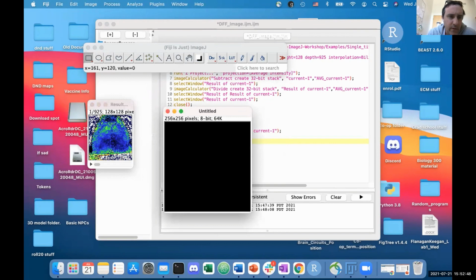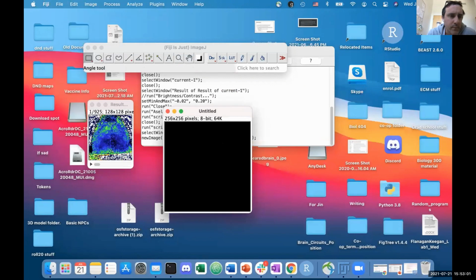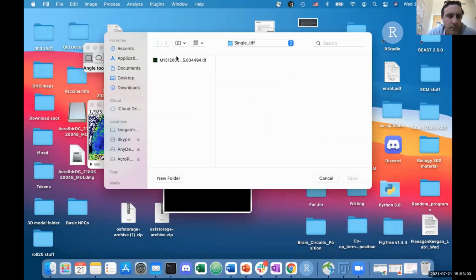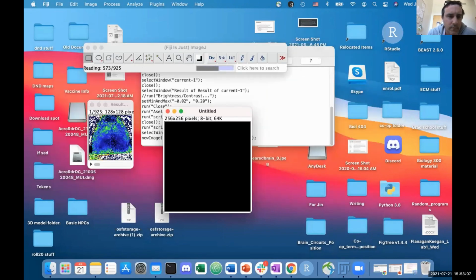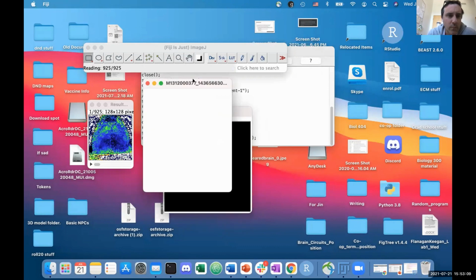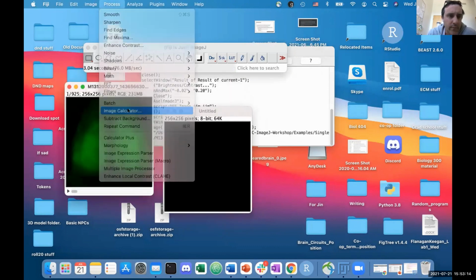Yeah. Okay, so then could you open the original TIFF file? Yeah. Open. And then, yeah, exactly.